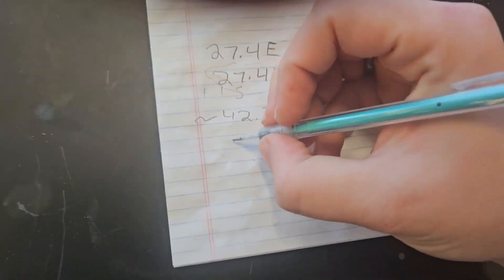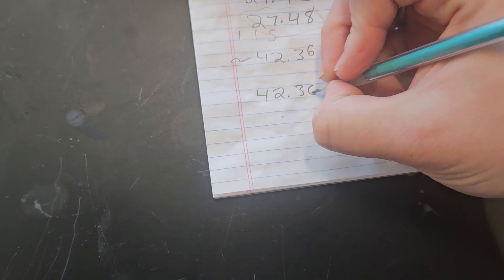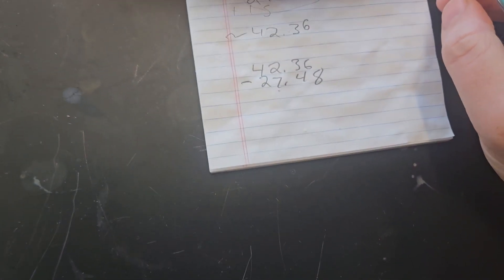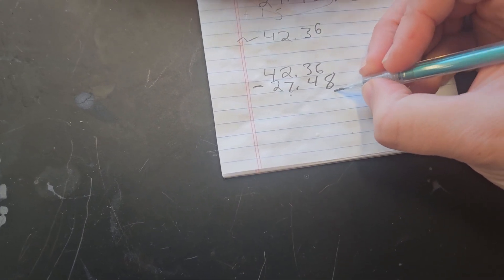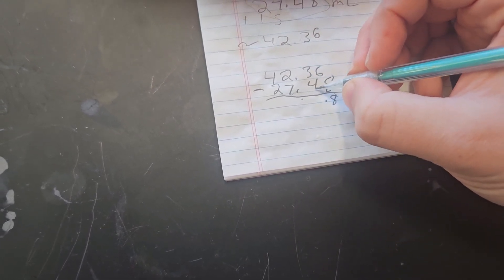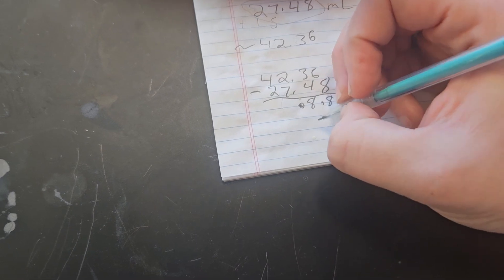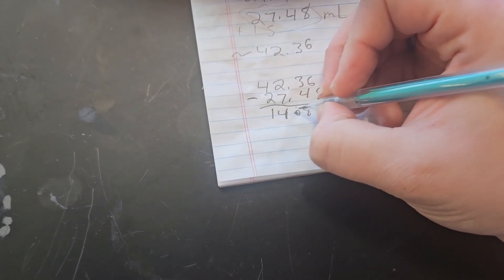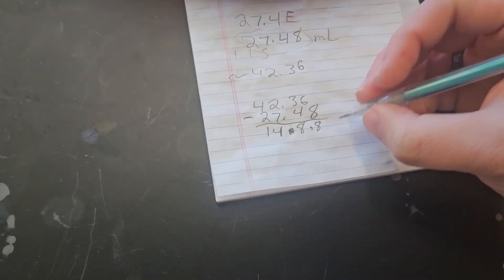To find out the volume delivered, we're going to do 42.36 minus my 27.48, and you can use a calculator to do this. You do not have to do it by hand. So the difference is 14.88 mils. I delivered 14.88 mils.